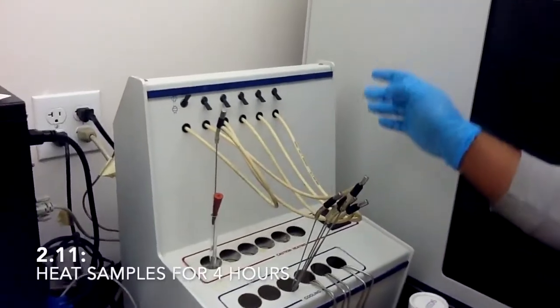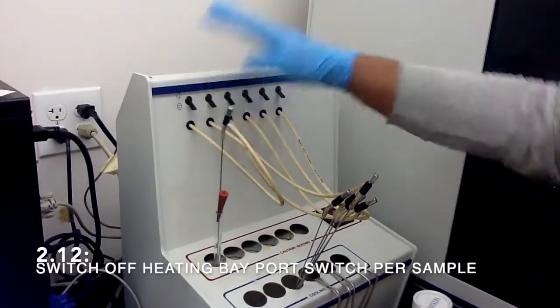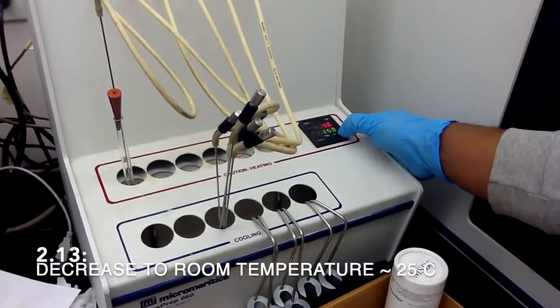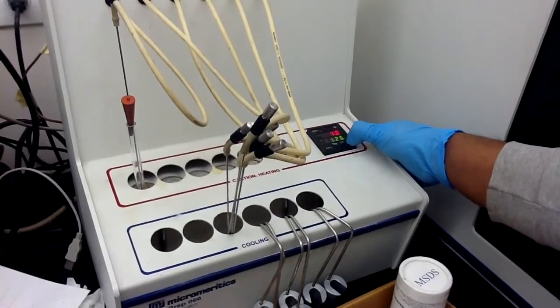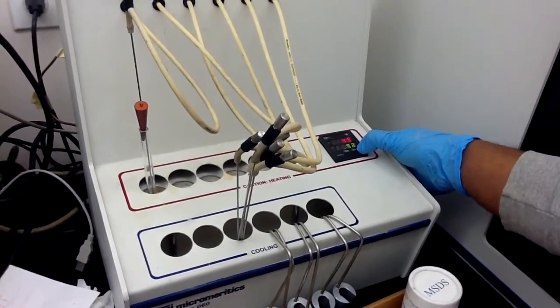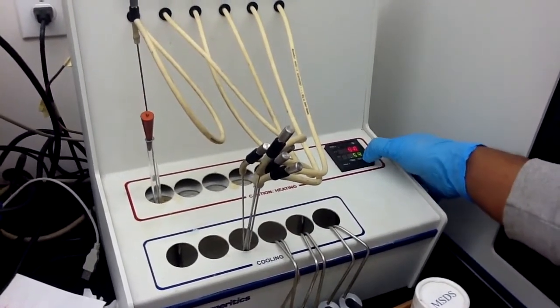After 4 hours you will come here, you will stop this bulb, and you also need to decrease the temperature. Suppose you need to set it at your room temperature. Previously it was 150, so you need to decrease the temperature to room temperature. I prefer 25 degrees Celsius. So I am decreasing it.